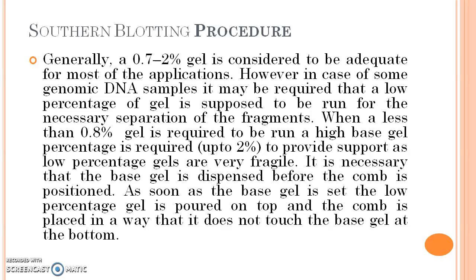It is necessary that the base gel is dispensed before the comb is positioned. As soon as the base gel is set, the low percentage gel is poured on top and the comb is placed in a way that it does not touch the base gel at the bottom.